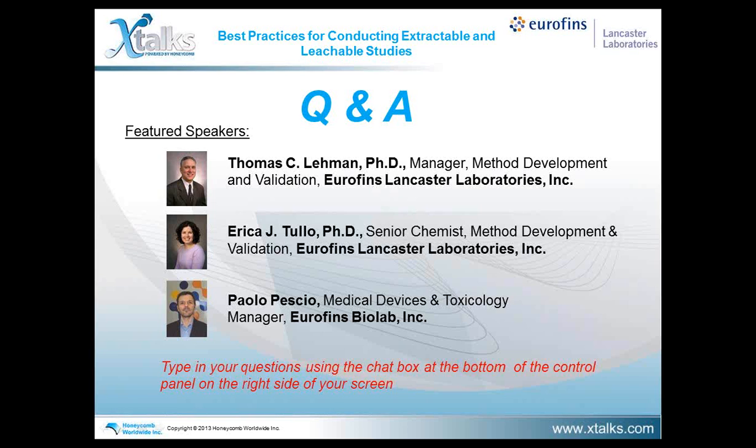Our first question here: is there an FDA guidance on how to perform or what aspects of the device or drug should be tested? There are guidance documents available, but what I will say is there is going to be an addition of USP general chapters on extractables and leachables studies. They are currently under draft. They will be appearing in the Pharmacopeial Forum in the latter half of 2013 with the intent to become active in 2014.